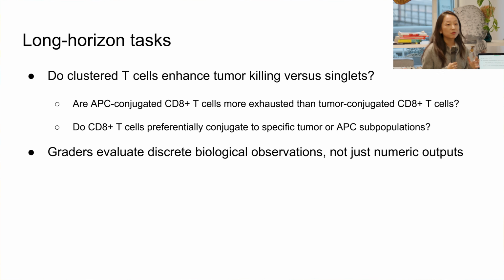We can actually test the analysis steps. So this type of question comes with its own challenge. With the modular category approach, most of our evals use a numeric metric as grader to grade whether the agent did the right thing. In the QC example, I just ask it to perform QC and see the number of cells that's retained, and then see if it makes sense, depending on tissue type or data.